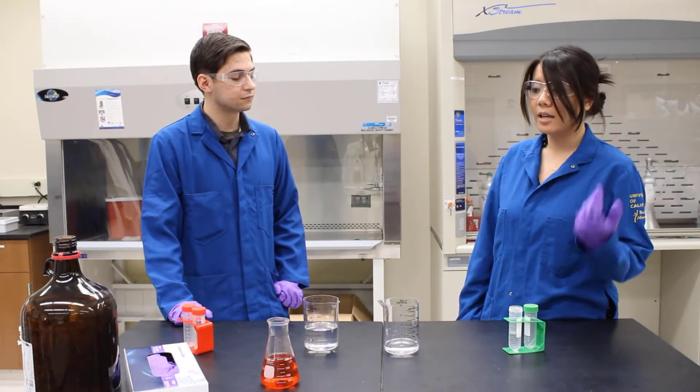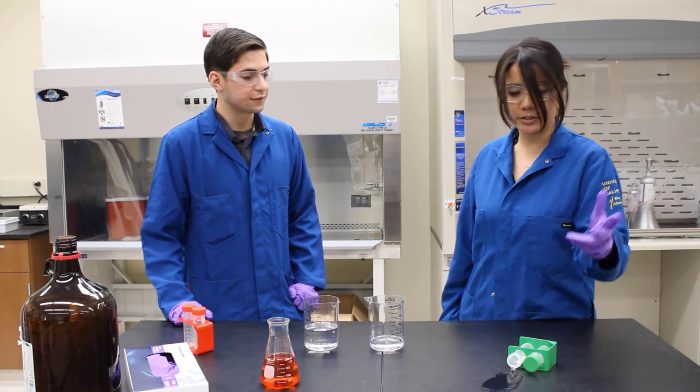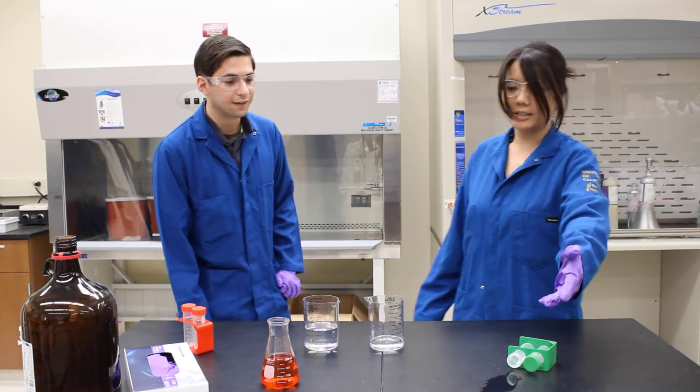If the spill occurs while you are working, you should already be wearing the proper PPE, and anything else appropriate for the hazards as outlined in the SOP.